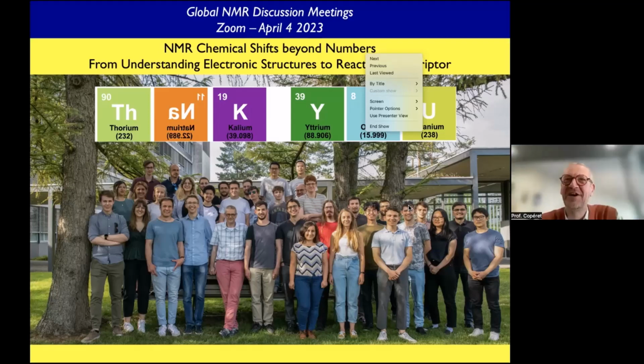So I think you have probably read our paper in JACS on these T sites. Right now, what we have found is that this quadrupolar coupling constant is very, very sensitive to the location. Okay. And maybe what you say is coming back to the question of Frédéric. And I believe it's probably not untrue.